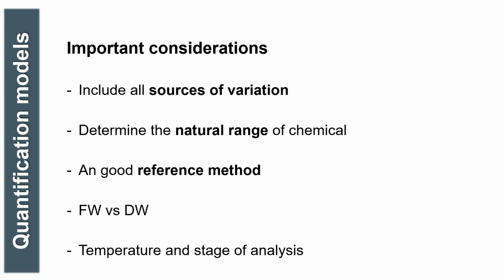The second last point is that if the model will be applied to quantify compounds in fresh samples, but the reference method determines the values on a dry weight basis, it will be necessary to convert the values used in the model to the fresh weight basis. Finally, the type of sample and the stage of the process where the model will be applied should be determined, and all of these factors should be incorporated when developing the model.